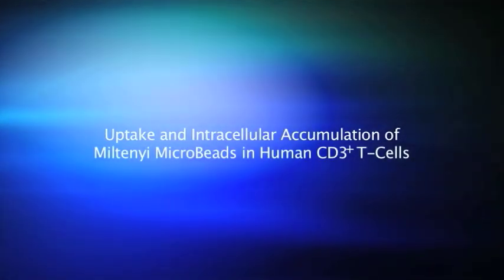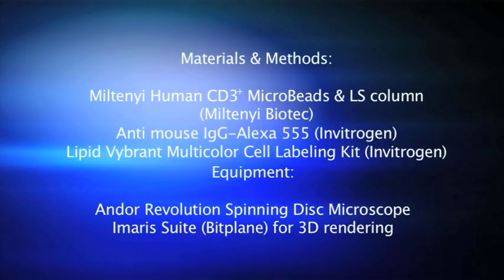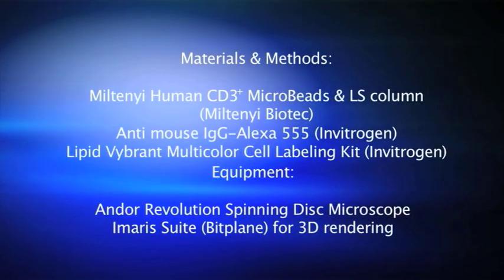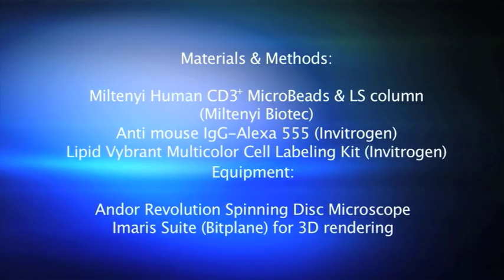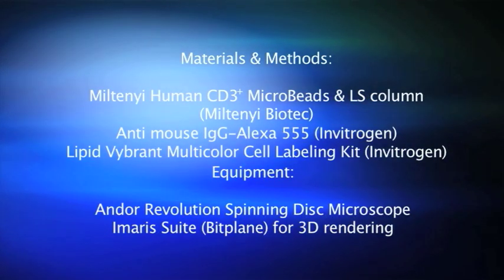Uptake and intracellular accumulation of Miltenyi microbeads in human CD3 T cells. Materials and methods. Miltenyi human CD3 microbeads were labeled with anti-mouse IgG Alexa 555, while human peripheral blood mononuclear cells were labeled with lipid vibrant multicolor cell labeling kit. This kit stains the lipid membrane blue.